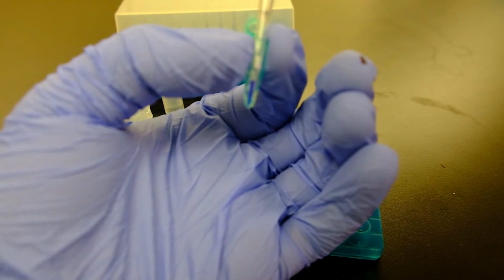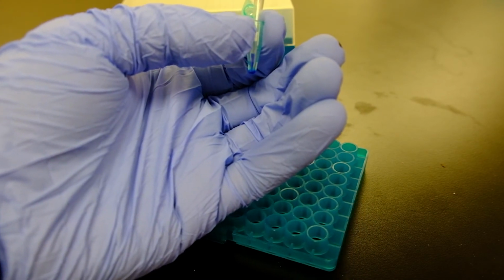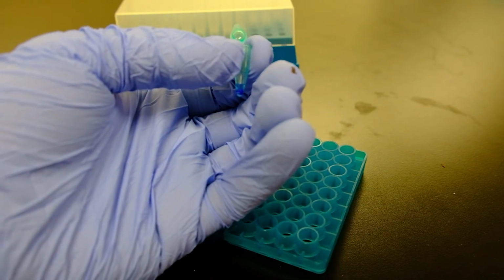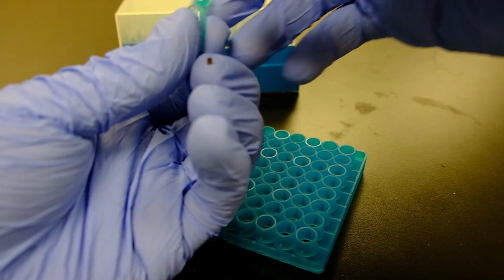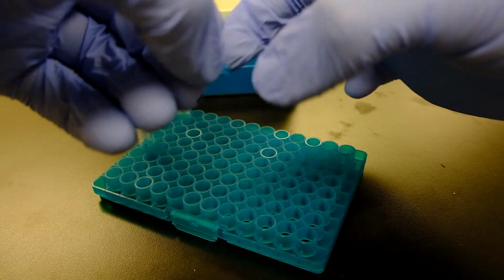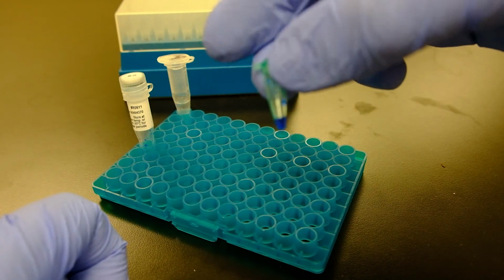Add it to your mixing vessel and pipette it up and down a few times to mix it well with the DNA. Also mix by flicking. It is important that all the DNA molecules in your sample make contact with the dye.